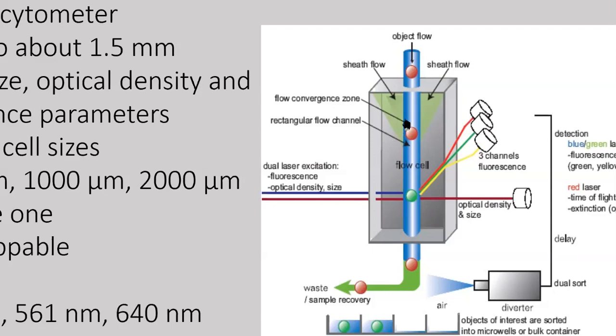So once the object goes through the lasers, and essentially as soon as it leaves the lasers, because all of this is happening at the speed of light, we already know that this is a green or a red dot, a red ball.